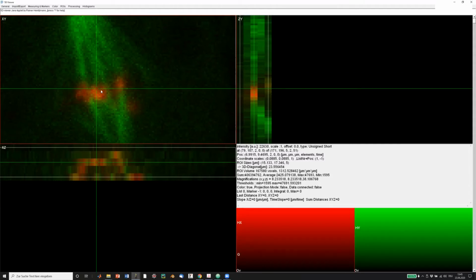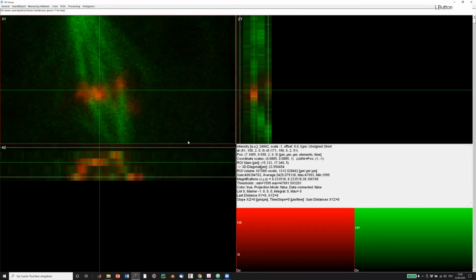So the key for navigating along elements is actually E for element and capital E for going backwards. And you might see that when I press E, like I do now, you see some of the values updating. So the values that are shown here correspond to the current color channel. And when I press E, I move from the red color channel, and you see that by this red line around the box here, to the green color channel. And now this red line, very dimly seen, is around the green color channel.